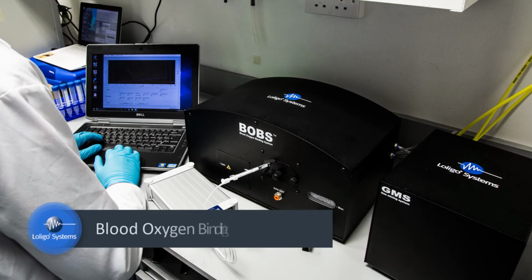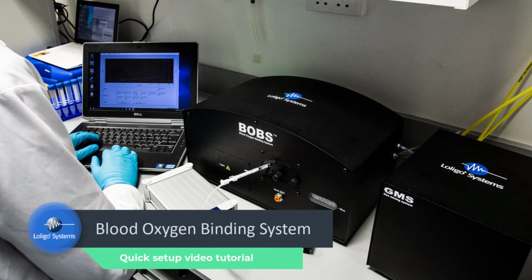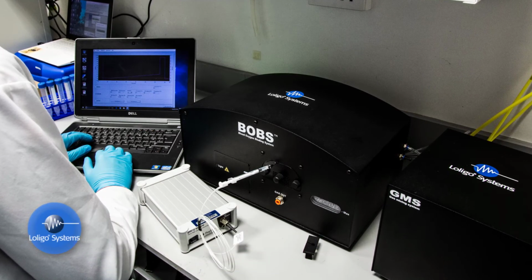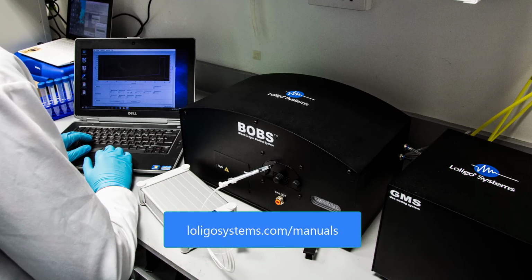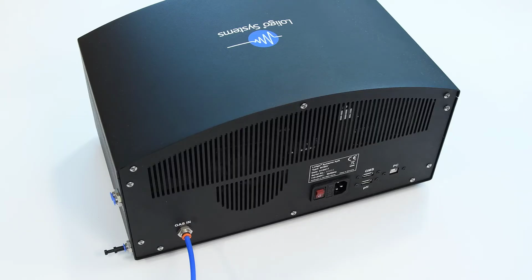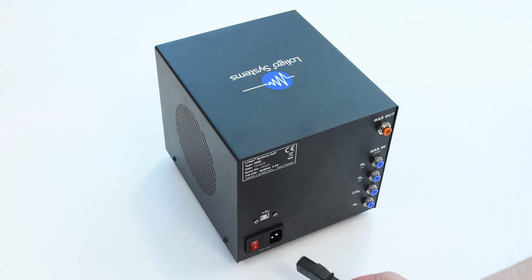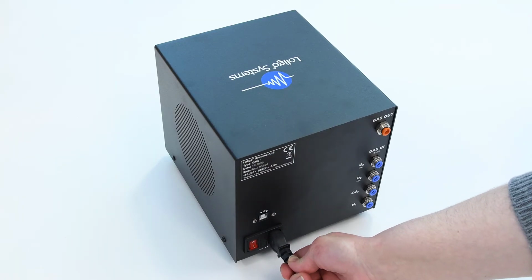This video shows you how to set up and get started using the BOBS system. For more detailed information, please see the complete BOBS user manual on our website. Start by connecting the power cables to the backside of the BOBS and GMS instrument and to a grounded outlet.